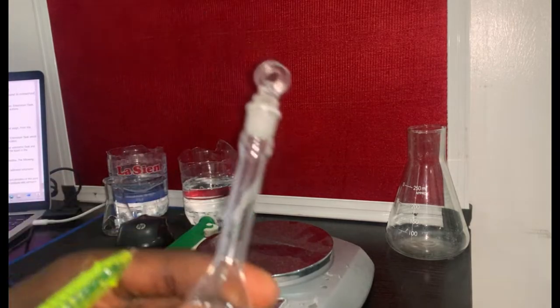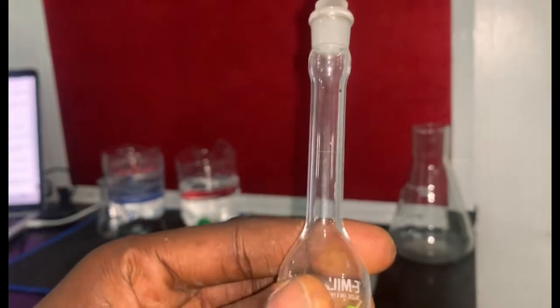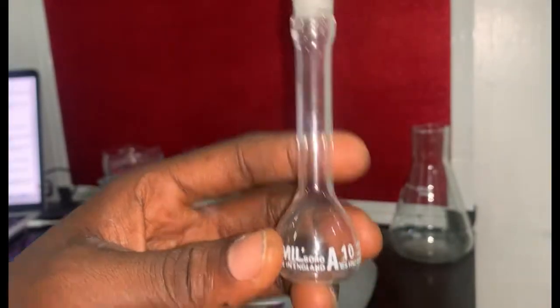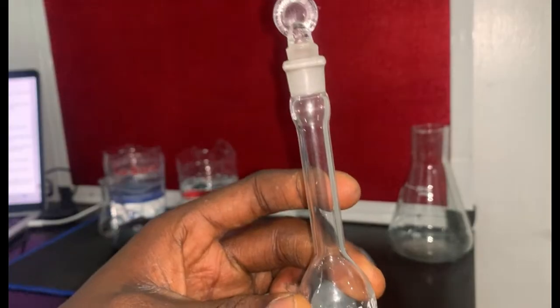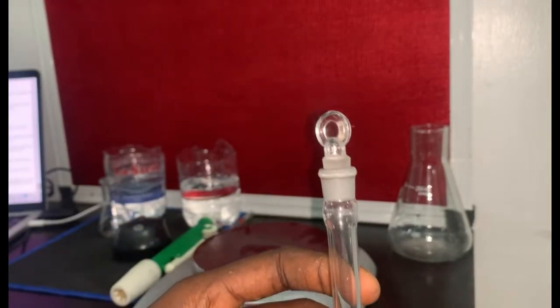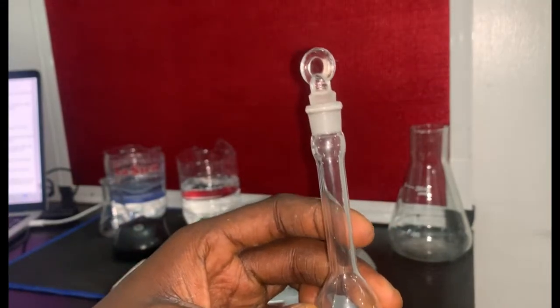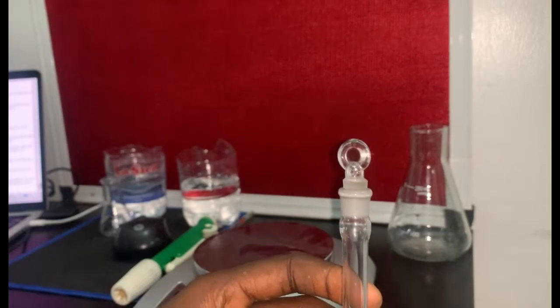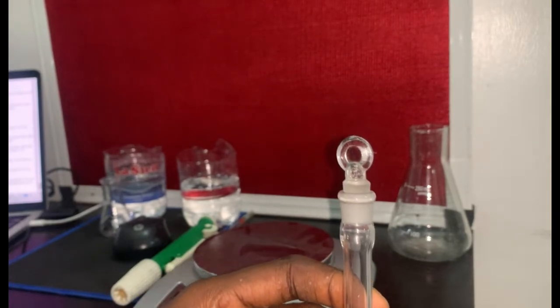Now, if you take a look at this flask, there is a line here, right? This line is actually the mark on the flask, and this is a 10 ml volumetric flask. You can see here it is 10 ml. So we want to calibrate this. The main purpose of calibrating is to make sure that the volume the manufacturers told us, 10 ml, is indeed the actual volume. So we need to carry out calibration to be very sure that this flask is indeed 10 ml.